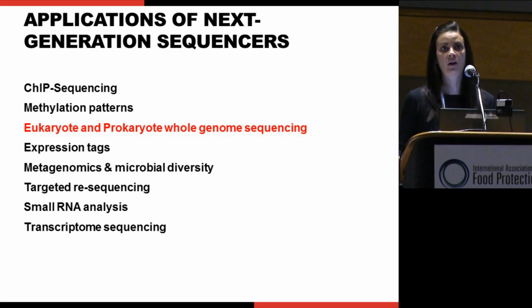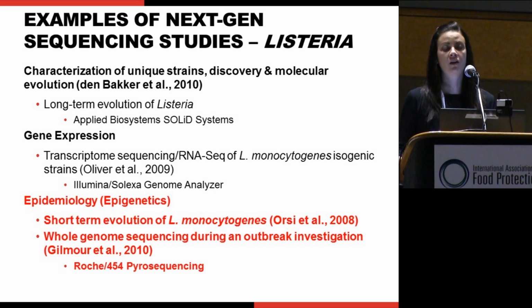Just recently in our laboratory, we were using RNA sequencing to understand what genes are turned on in Salmonella when it's attached to romaine lettuce as compared to stainless steel slides. And we got some really interesting information and preliminary data that was used for a grant proposal.